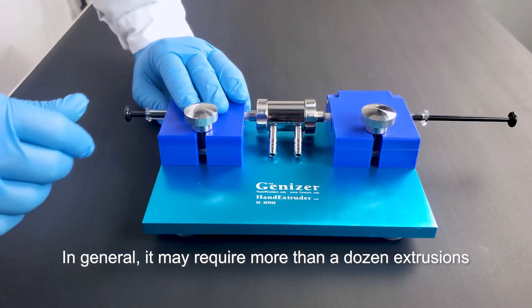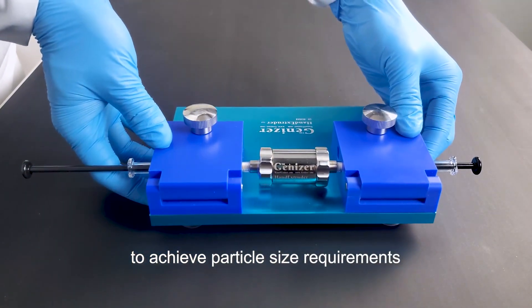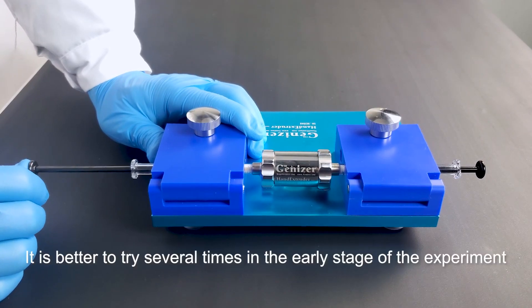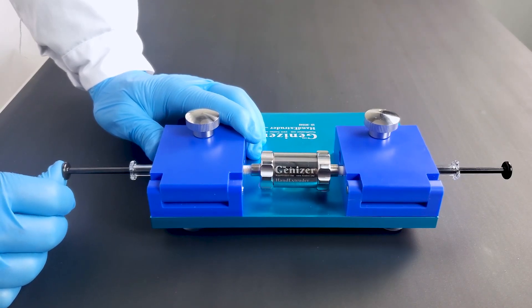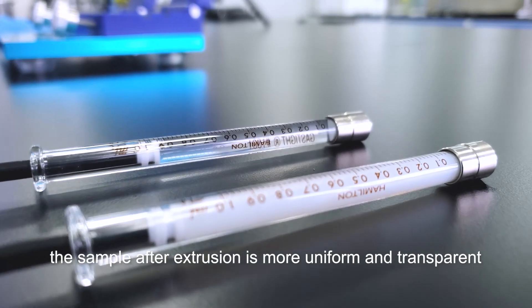In general, it may require more than a dozen extrusions to achieve particle size requirements. It is better to try several times in the early stage of the experiment to get the best results. As you can see, the sample after extrusion is more uniform and transparent.